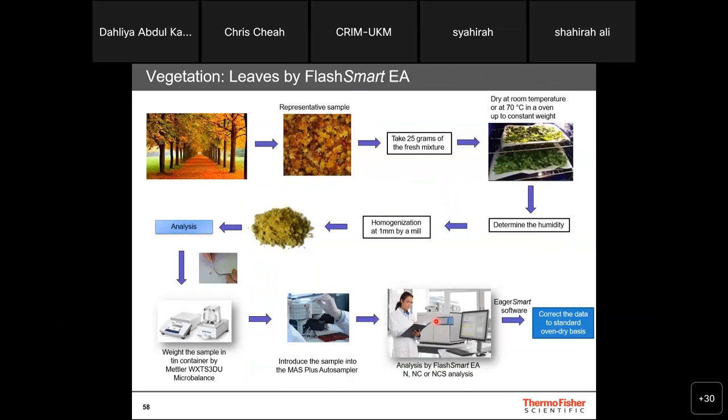Other monitoring work is to monitor certain plantation leaves, to check whether any industrial area always emits toxic gases or pollutes the environment. They will go to the industrial zone, where of course there is always a tree, and collect the leaf. They will dry it, remove the moisture, grind it, then analyze. So this is the approach.